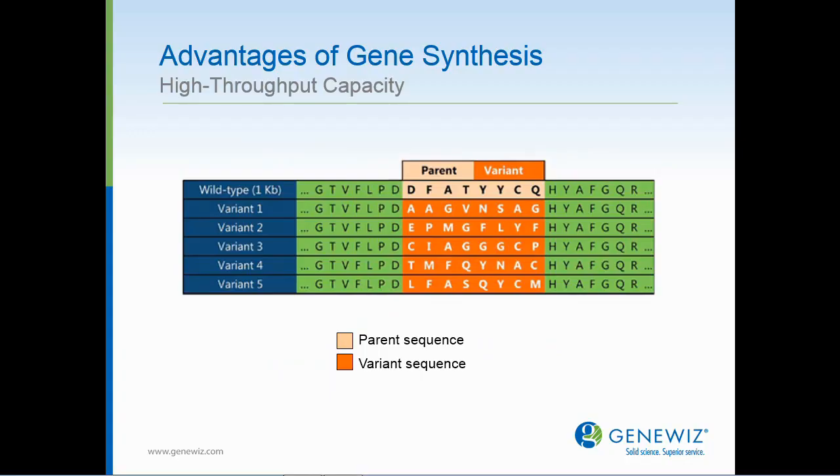High throughput capability is also an advantage. Now let's say that one wishes to study the combination of changes of a desired protein region of interest. And thinking ahead, you would like to generate these isoforms at the same time for either subsequent testing or side-by-side analysis. In this aspect, one can exploit the process of gene synthesis based on sequence similarity to create these isoforms.